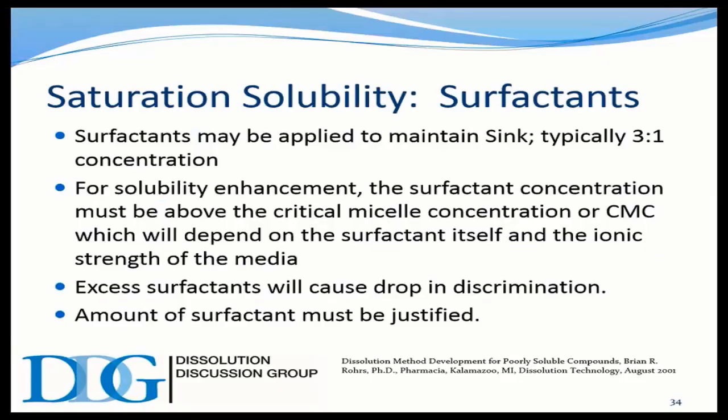Now, does that mean you have to have 3? I'm going to say right now that FDA has accepted product that may be slightly below that, but they've been justified to control that release where it does not typically suppress the rate before you reach that amount where it's saturated. But you'd have to have a bit more justification there.